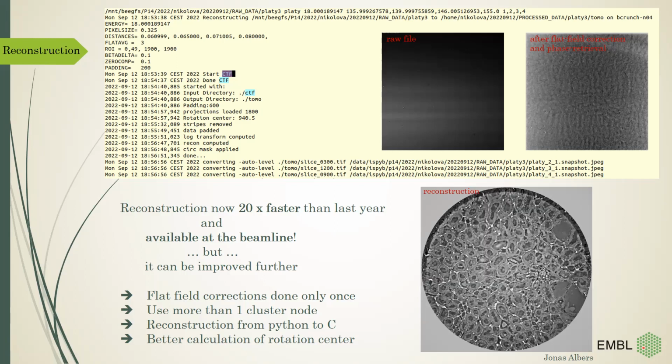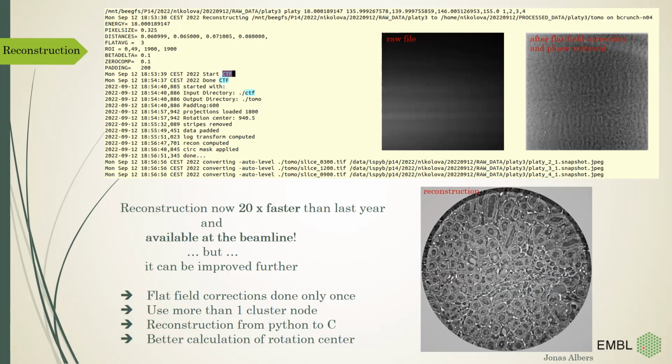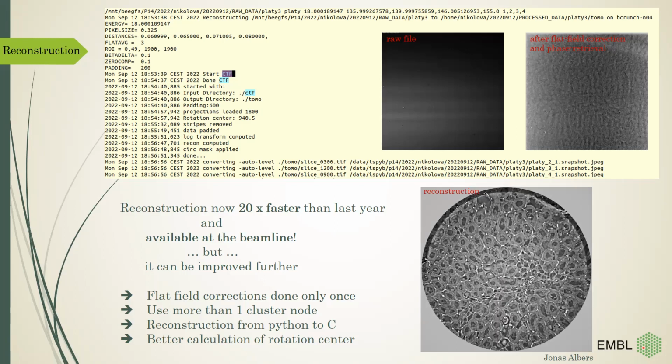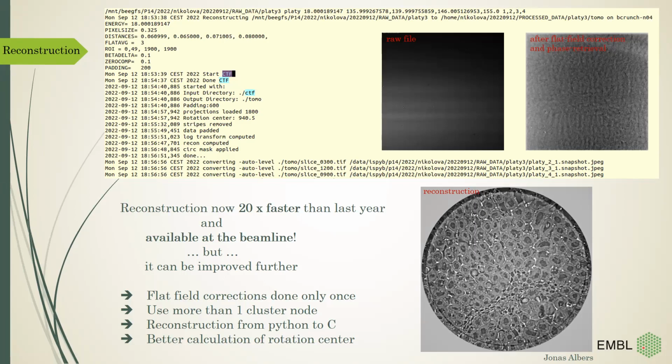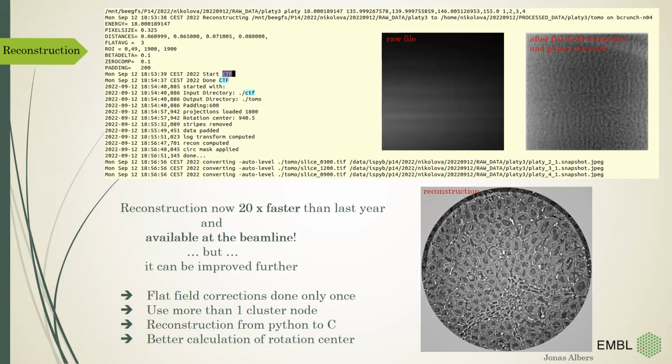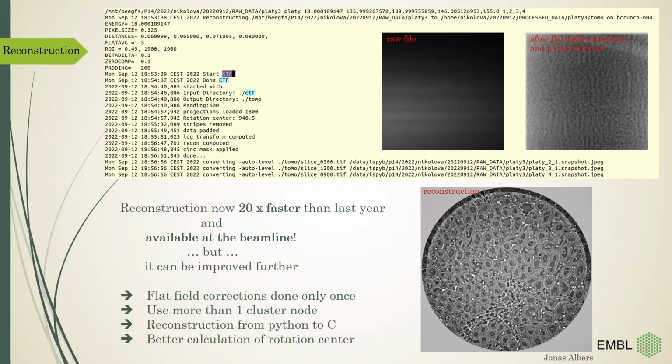So I'm finishing. In conclusion, with the system that we presented here, we allow for the instantaneous availability of frames for display and processing. Real-time analysis is happening in the control system, and we do it via DOZOR for crystallography, and we do flat field corrections for imaging. We immediately deliver processing results to the users. In the case of imaging, we still have a lot to improve, because those 3 minutes at the end that we have to wait for the reconstructions are still too long for us, and we want to make that even faster.